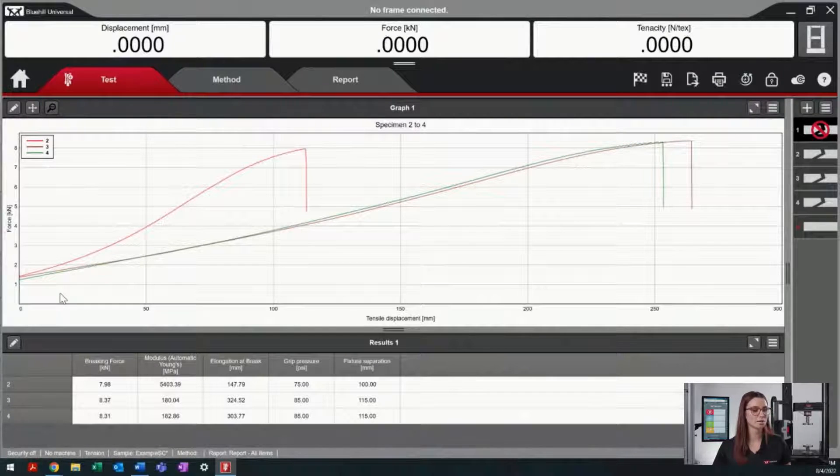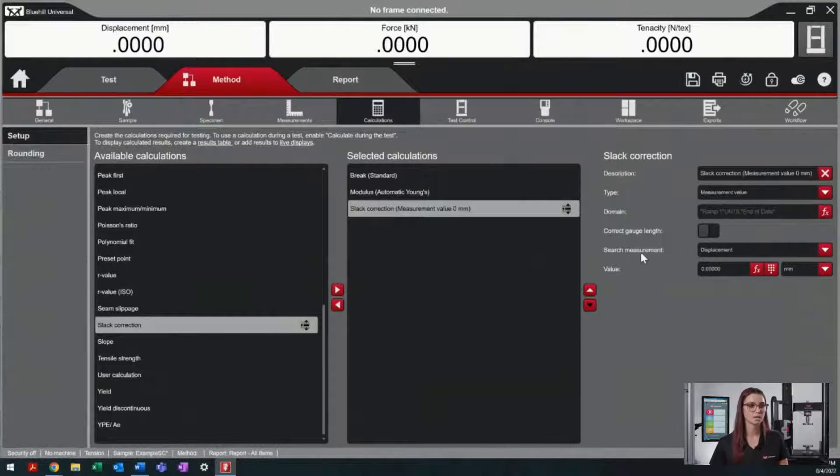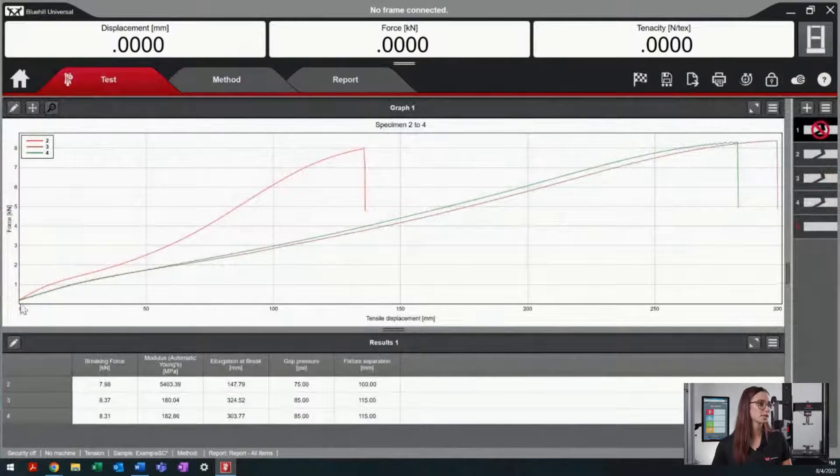This is unideal because we're not seeing the beginning of our curve. So now we would go back into our method tab to update the type of test we're using. The measurement value calculation is the most commonly used calculation at the Instron application lab. This way, you're able to use a searching measurement such as force. By updating this to 2 kN of force, we're able to see an adjustment in our curve while allowing us to see our entire curve, but also reducing the slack within the specimen.